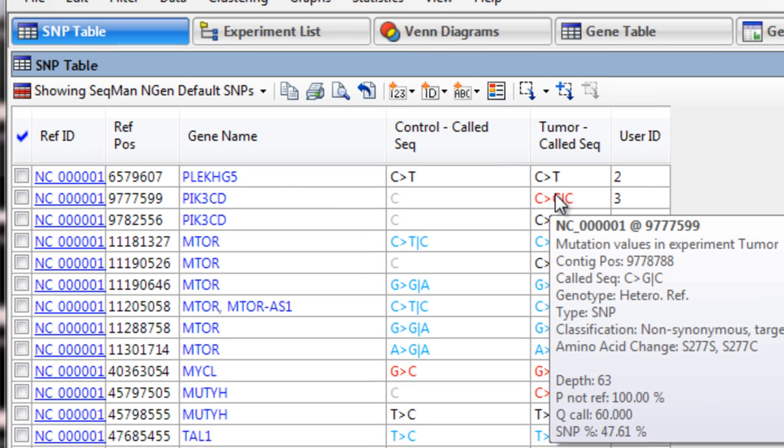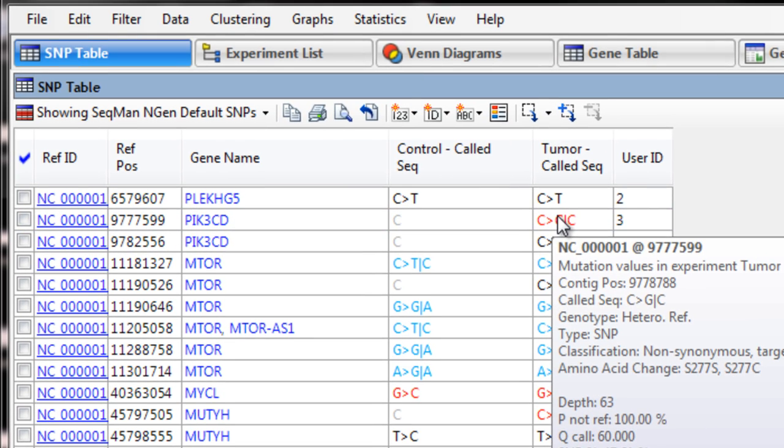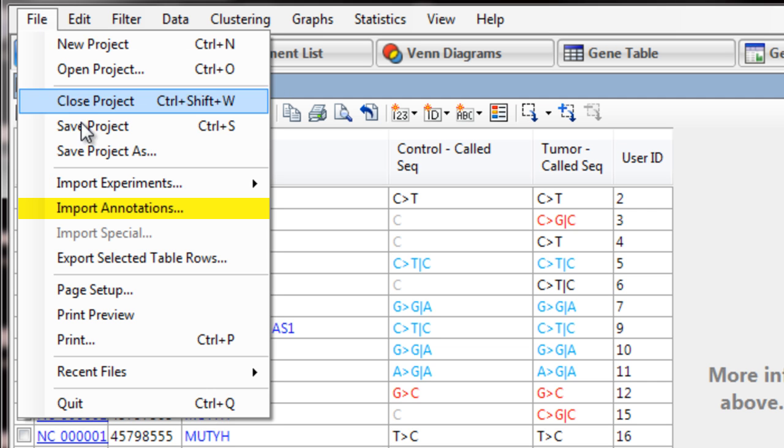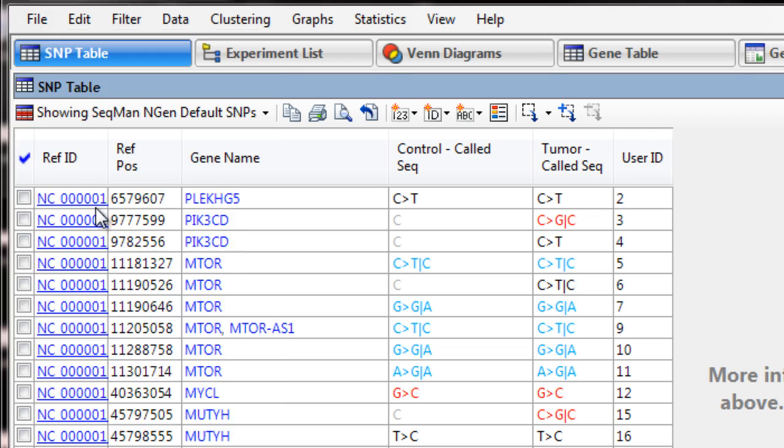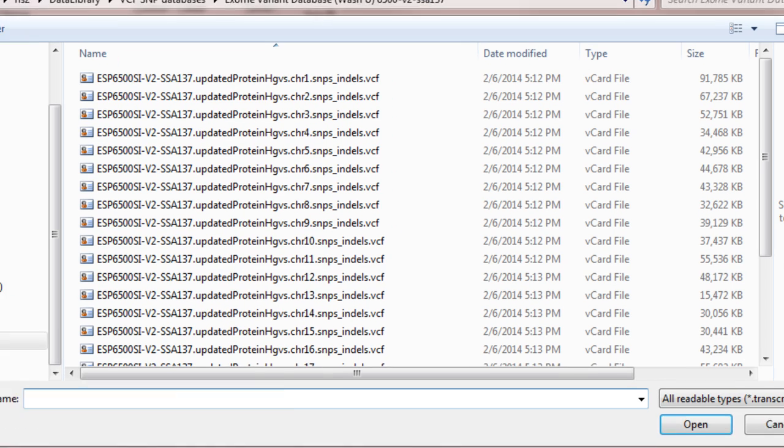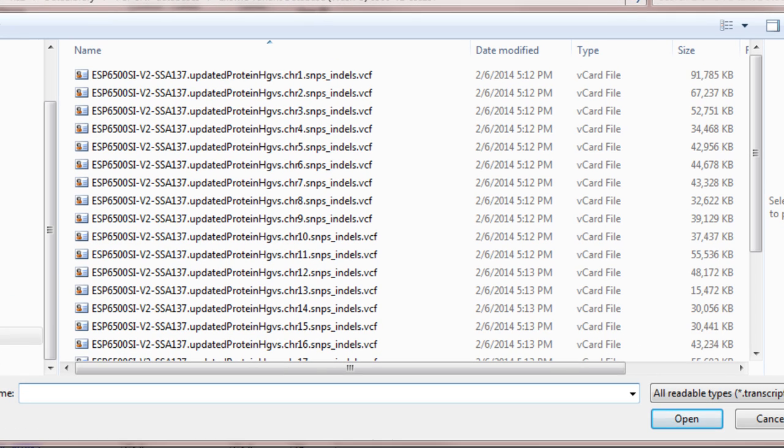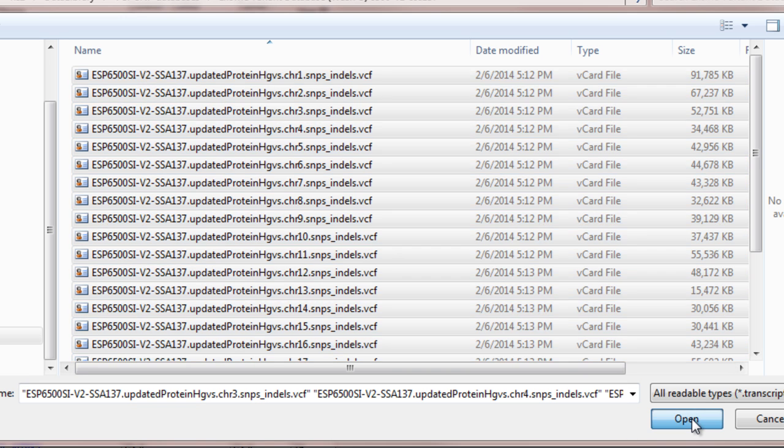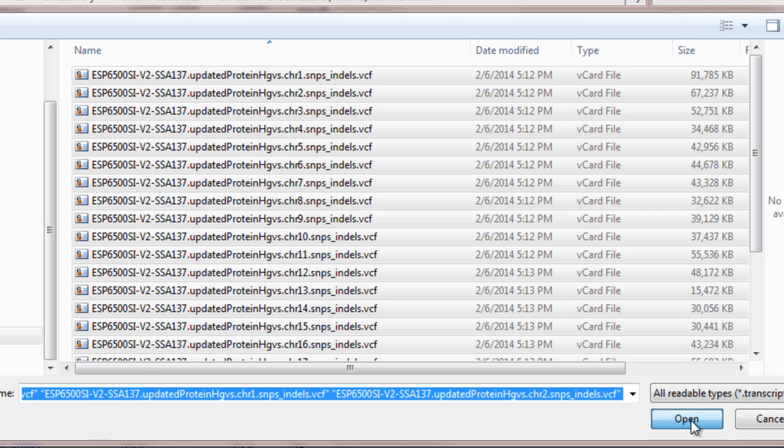ArrayStar also allows us to import VCF files with annotation information. To do this, go to File, Import Annotations, then locate your VCF file or files. For example, here I will load some VCF files from the University of Washington Exome Variant Server.